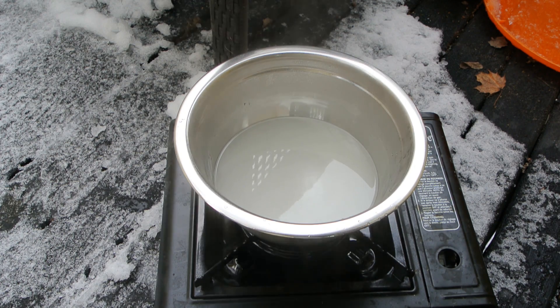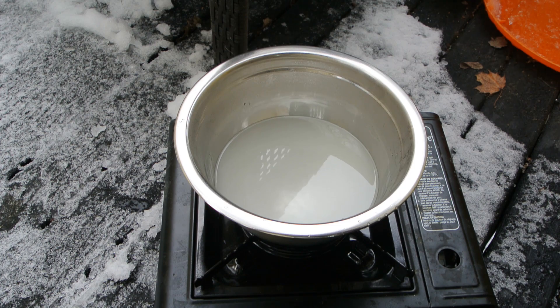Now that it's dissolved, I'm going to start adding some of the silica gel to it a little at a time and stir.